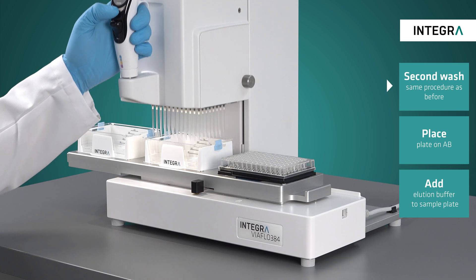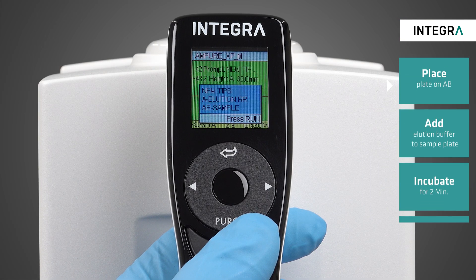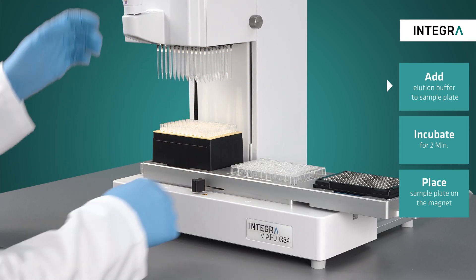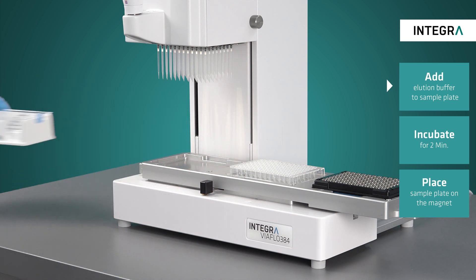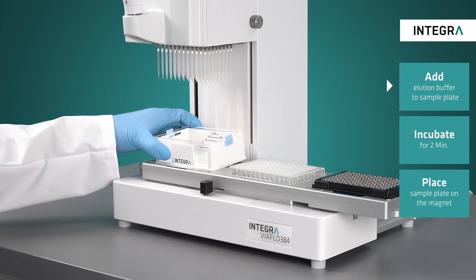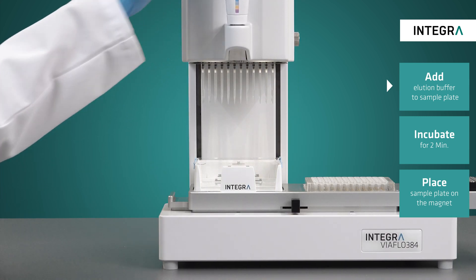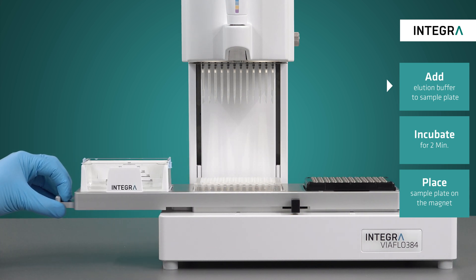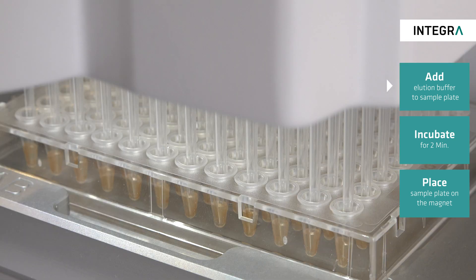With the washing finished, sample elution can now begin. The sample plate is removed from the magnet and placed on position AB, and after loading new tips, the elution buffer in the reservoir is placed on position A. 40µL of the elution buffer is then added to the sample plate and mixed together thoroughly in order to homogeneously re-suspend the beads.